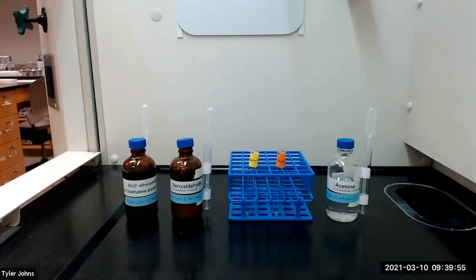We will begin by reviewing the Tollens test. The Tollens test allows us to differentiate between aldehydes and ketones as most aldehydes reduce ammoniacal silver nitrate solution to give a precipitate of silver metal. The aldehyde is oxidized to a carboxylic acid, while ordinary ketones do not give a positive result in this test.